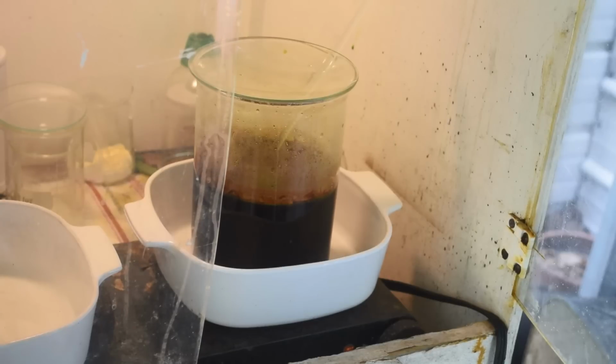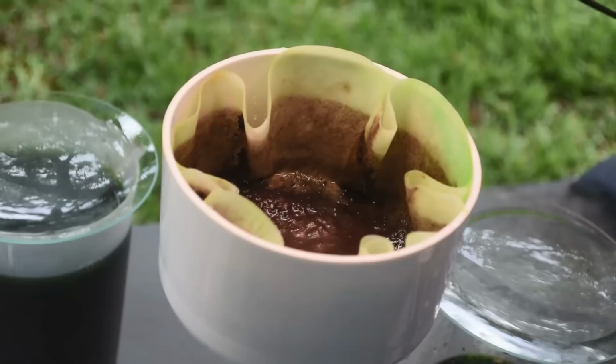Well, once again, filtering is a bottleneck because it is slowed down to a crawl over there, and I've got a funnel full of red liquid. So sooner or later, I'll get it all filtered, though. I'll get all the filters in a beaker, and then we can move on to doing something else.